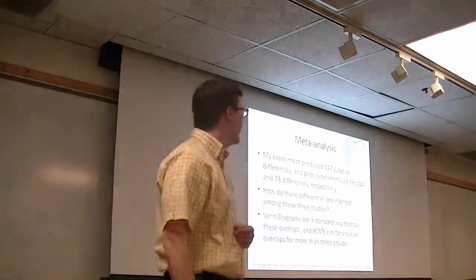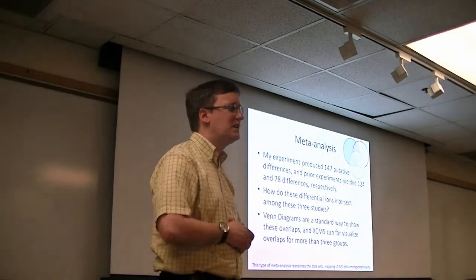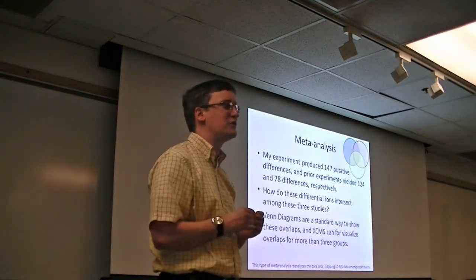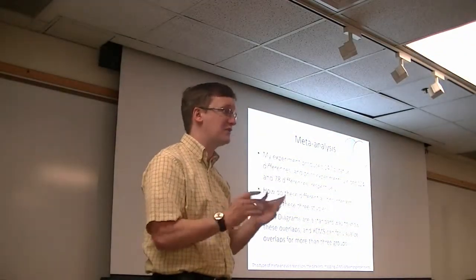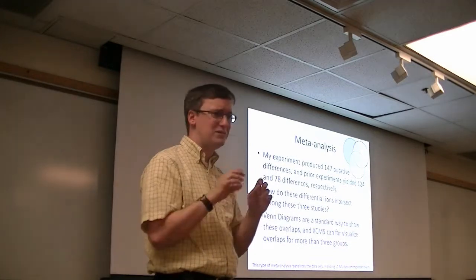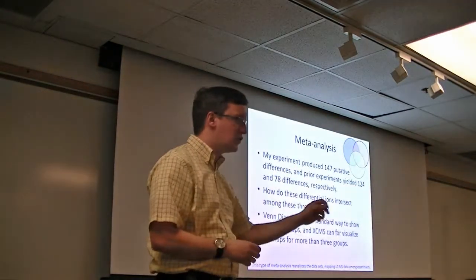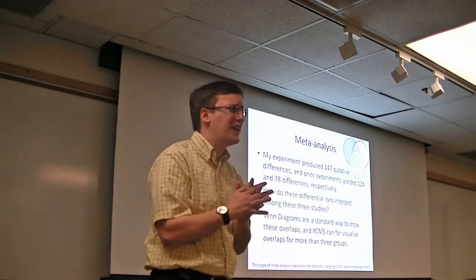Also, there's a very handy tool called Venny. I don't know if you've had a chance to see it, but it seems like when I see posters at conferences, 9 out of 10 Venn diagrams have been produced by it. It's a very useful site, and I would encourage anybody who hasn't worked with it to use it. For example, if you put in the names David, Charlie, and George, and then put in Anita, Charlie, and George, the software will figure out what the overlaps are for you. So it's really quite handy.